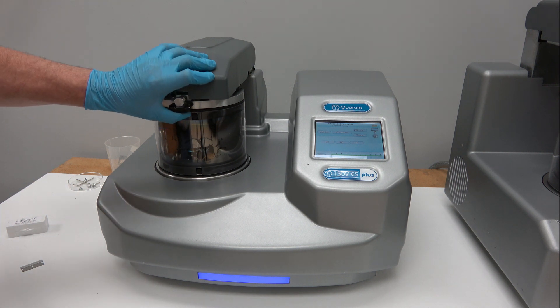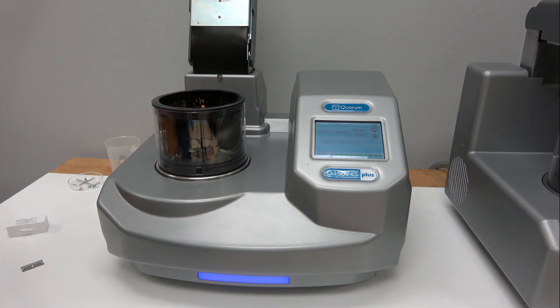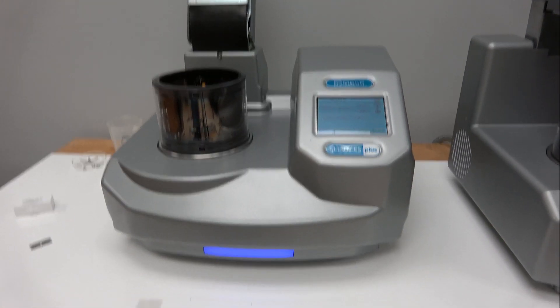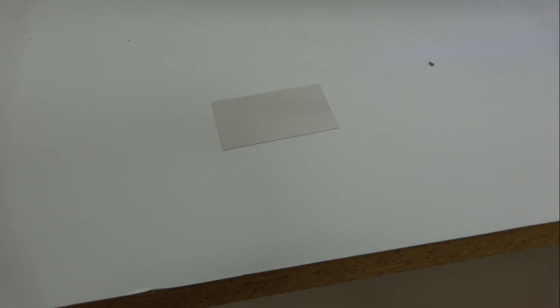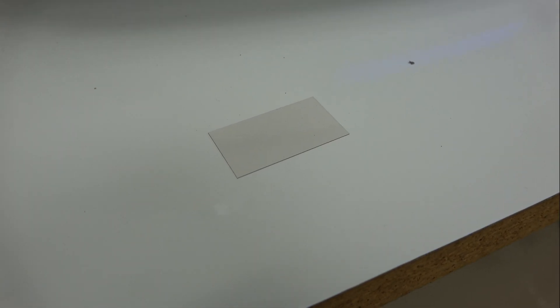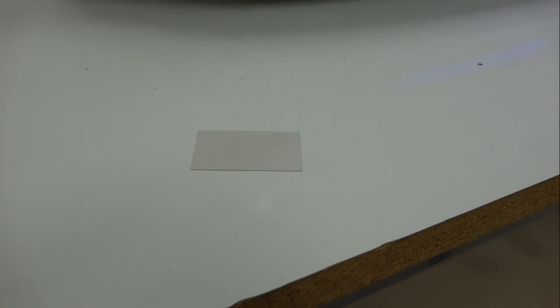Turbo molecular pumps generally spin at 60,000 RPM when at full speed, so we don't want to G-shock the pump. Process is done — you can remove your substrate. You can see the carbon coat we put down with a single pulse at that particular current — I would say that's probably 8 to 10 nanometers of carbon. If you want it thinner, do less time or less current; if you want it thicker, do more current, more pulses, more time.